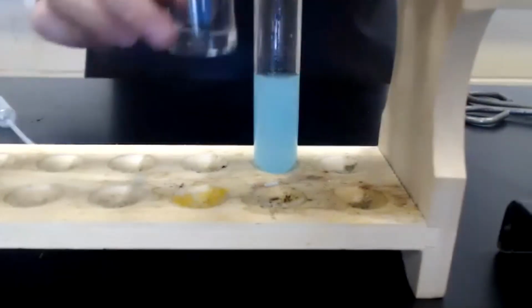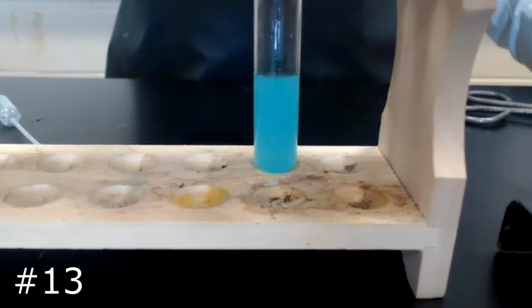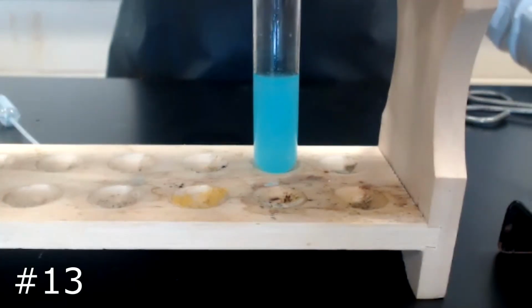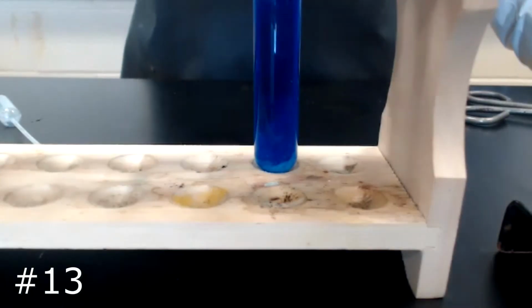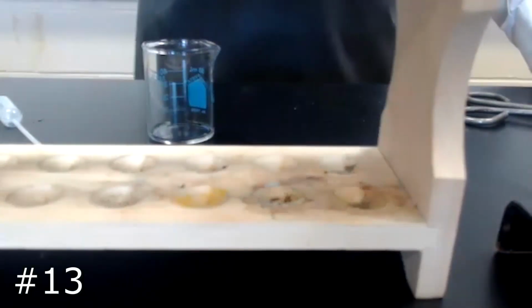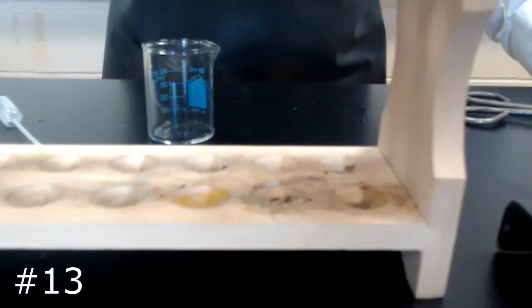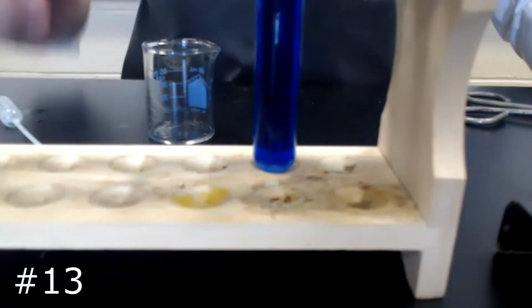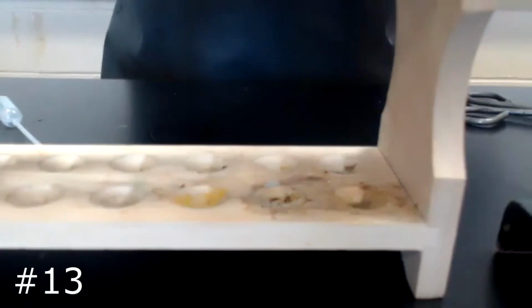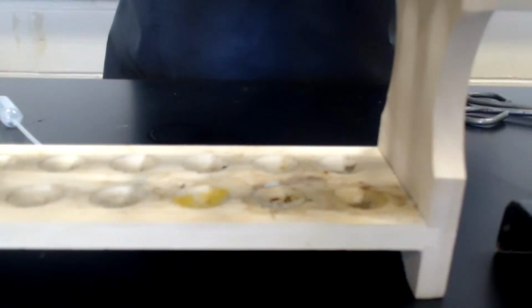I'm now going to add an excess of ammonia to our sample. Notice, even though the sample has changed color once again, it is now transparent.